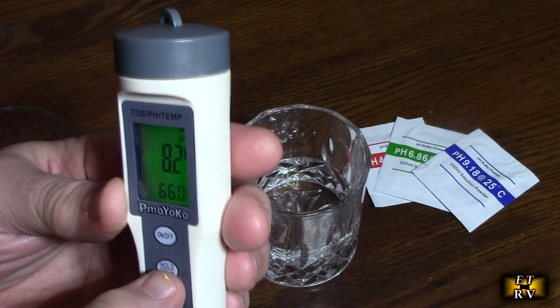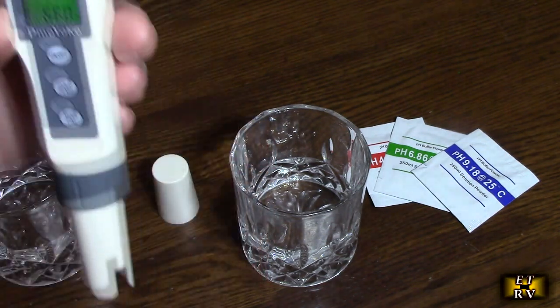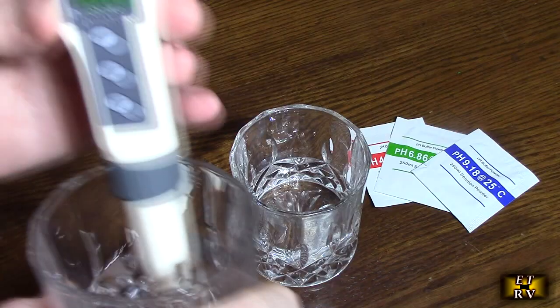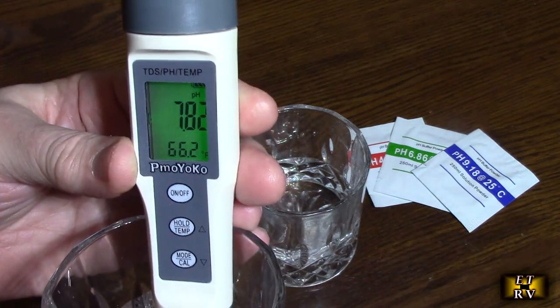There is a hold button. So if you hit that hold button, it's going to lock in that value, whatever it is. So let's just look at the water right here. That was the tap water, and you see it's got the pH shown 7.82.